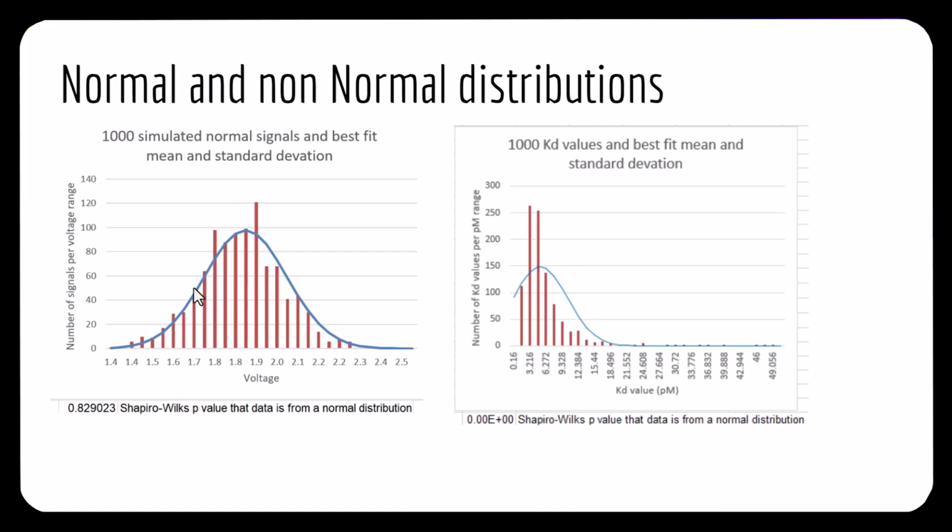That looks plausibly normal to me. As I fill in a bunch more points, I can imagine this might converge on a normal bell-shaped curve. The other thing I did is use the Shapiro-Wilks test, which is a test of normality. It calculates the probability that your population could be normal and your data could be as far from normal as the data you're presenting. What's the probability that that could happen? And it's 0.83, so it's quite high.